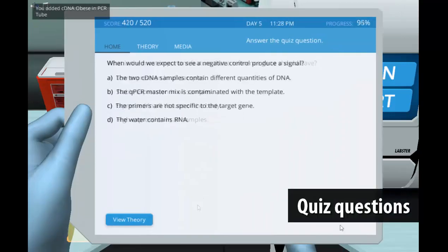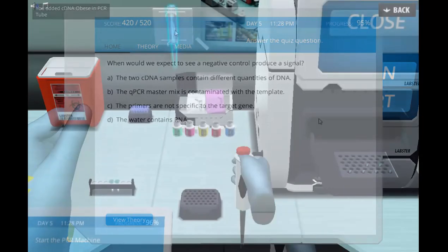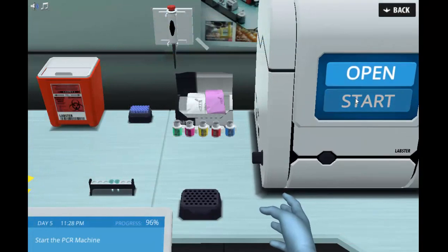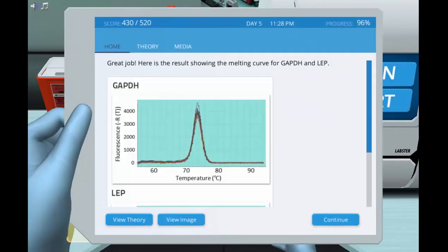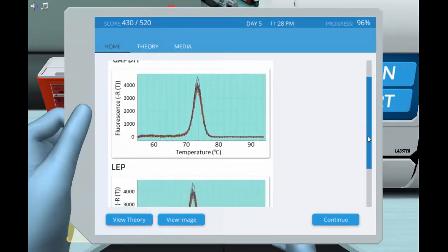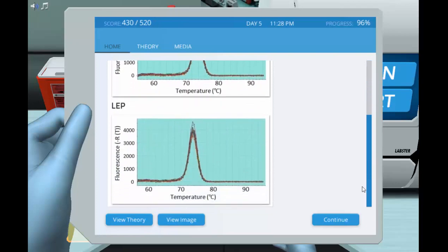Quiz questions will be asked throughout the experimental processes. Students will prepare the qPCR reaction and obtain the melting and standard curves. Would you find a gene responsible for obesity?